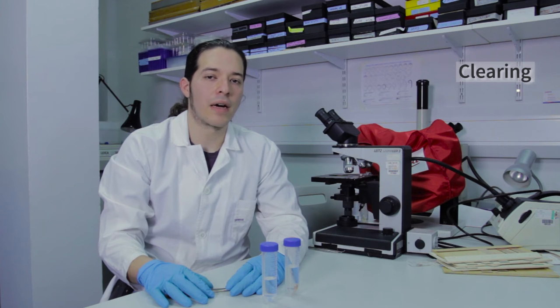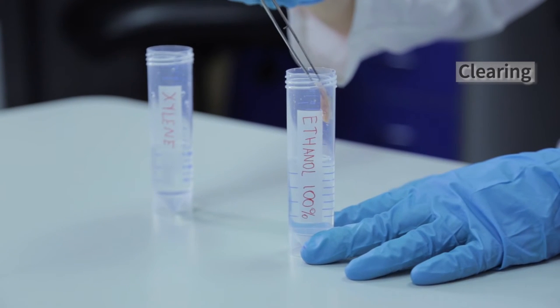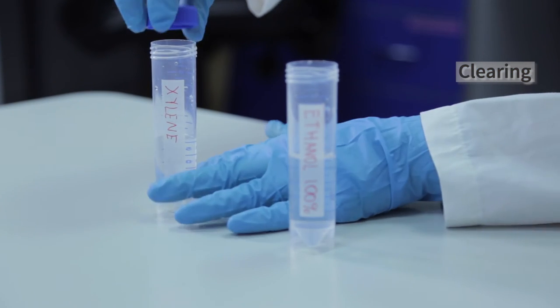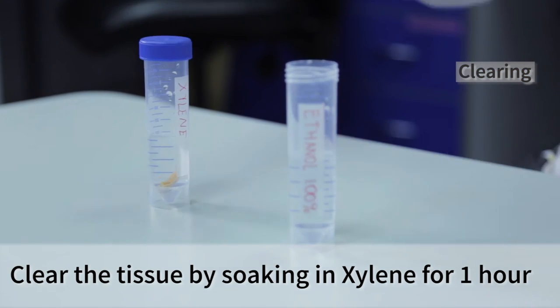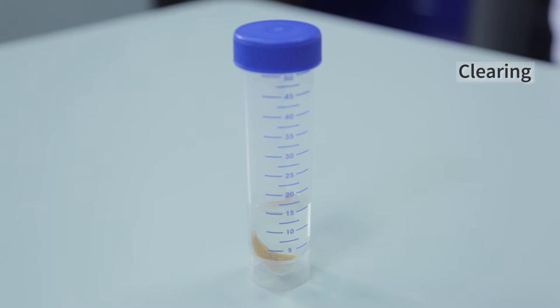Clearing refers to the property of the solvent used. They have a relatively high refraction index. When tissue gets into the solvent, it becomes transparent. This will help us to improve the signal we get from the in situ. The clearing agent needs to be miscible both with ethanol and wax. Xylene is normally used for this. It will also help us to remove the lipids from the tissue.